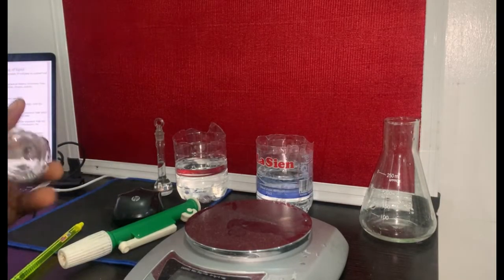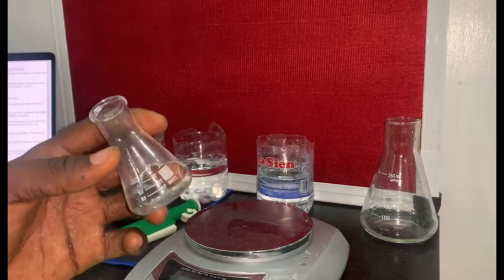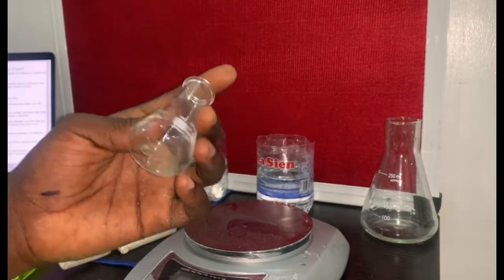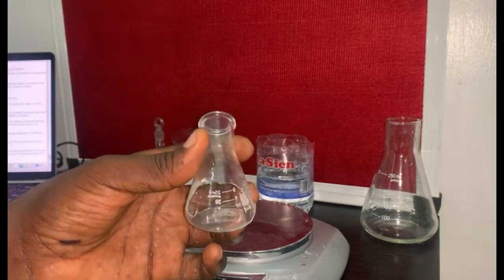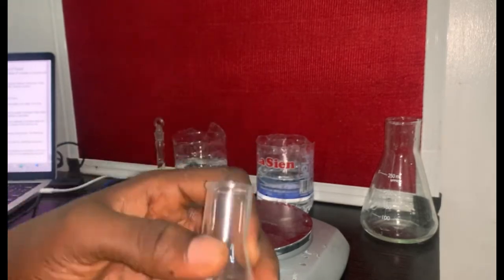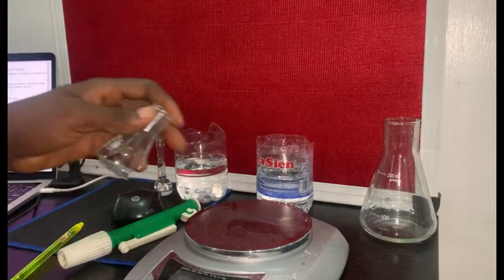okay, guys, unfortunately I won't be making use of this flask. Sorry, I was supposed to tell us at first. I think the first day I carried out the practical in class, some of the students actually damaged this flask. So I've been trying to get a new 25 mil, but I've not been able to do that. So I'm just going to be explaining this procedure here. I won't be delivering anything to this, but I had already measured the weight of this, so I'm just going to put it on the weight and then check if it's going to give us the same thing. But I already measured the weight of this when it was still complete and intact.